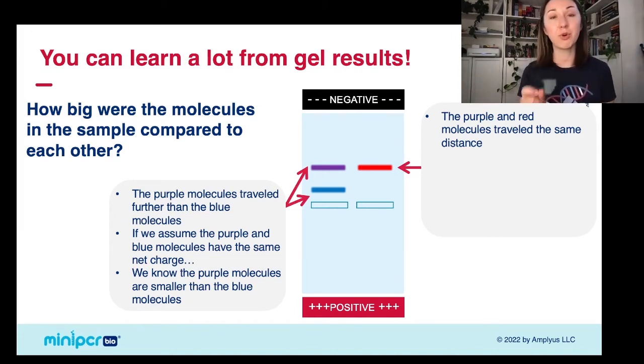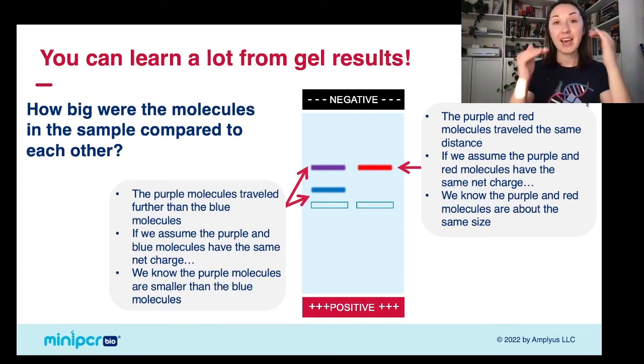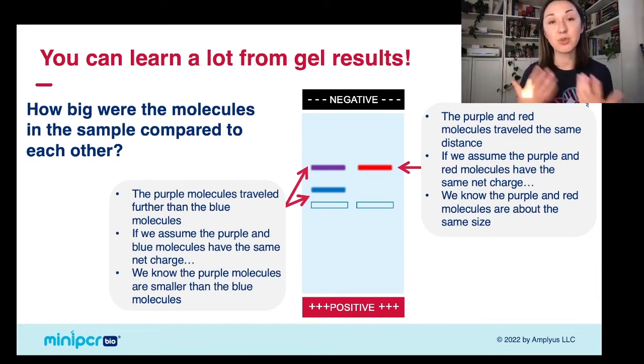On the other hand, we can also compare between lanes in a gel. And this is really important, especially if you have standards of known size. You can load a lane full of standards and then load some lanes of unknown sizes, and you're able to compare them together because, like in this example, when two bands, like our purple and red band, travel the same distance through the gel, you can assume that, again, if they have the same net charge, they also have about the same size. So this is really important when we think about DNA gel electrophoresis. Again, if we have standards and we're looking for a piece of DNA of known size, being able to compare between lanes is really, really important.